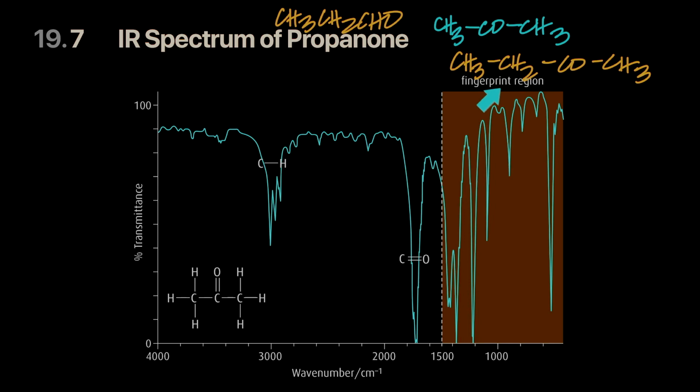Infrared fingerprinting works similarly. Tomorrow, for example, say you are a chemical analysis company. You will have millions of molecules' fingerprint region data. So tomorrow, if I give you an XYZ molecule, let's say I give you propanone, and you do not know it was propanone. So you'll get this, and you might say, well, the compound is an aldehyde or a ketone. That's all I can tell you by looking at this region.